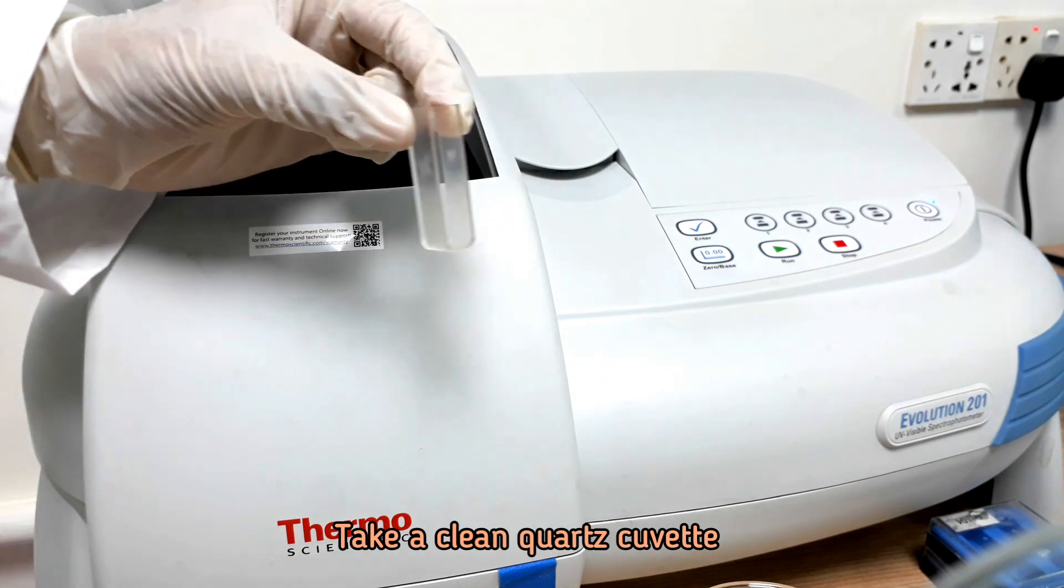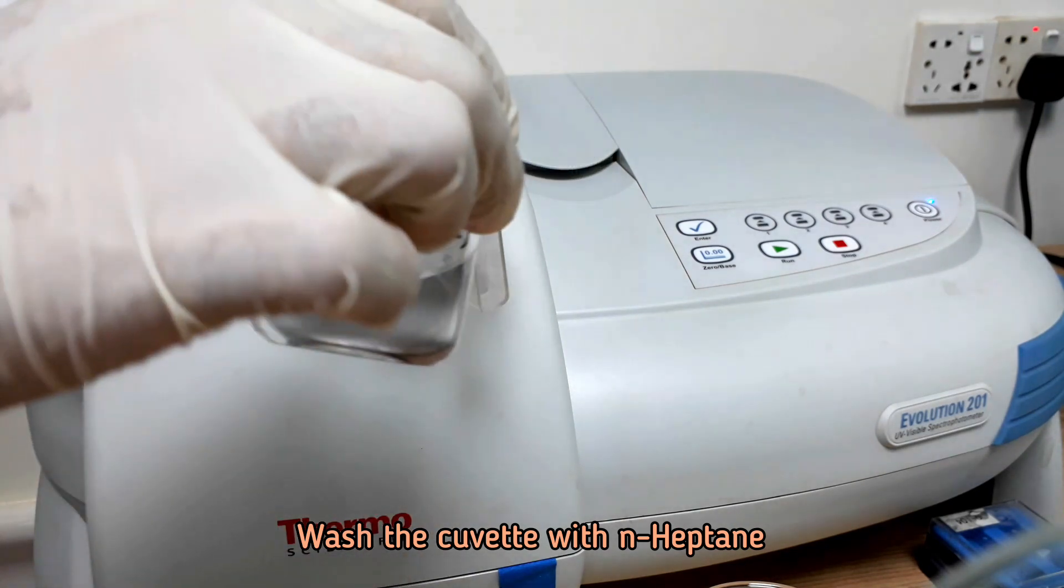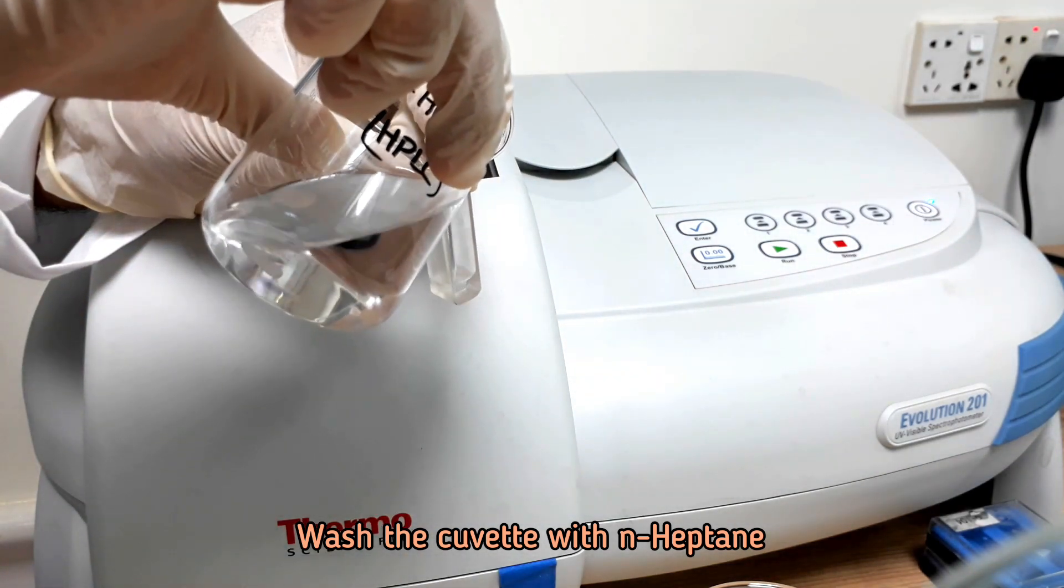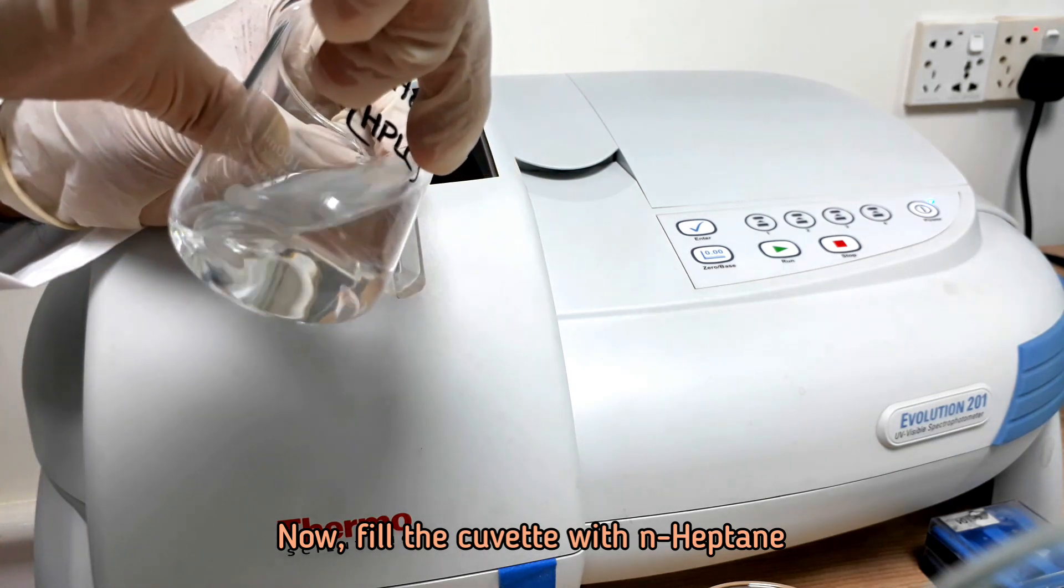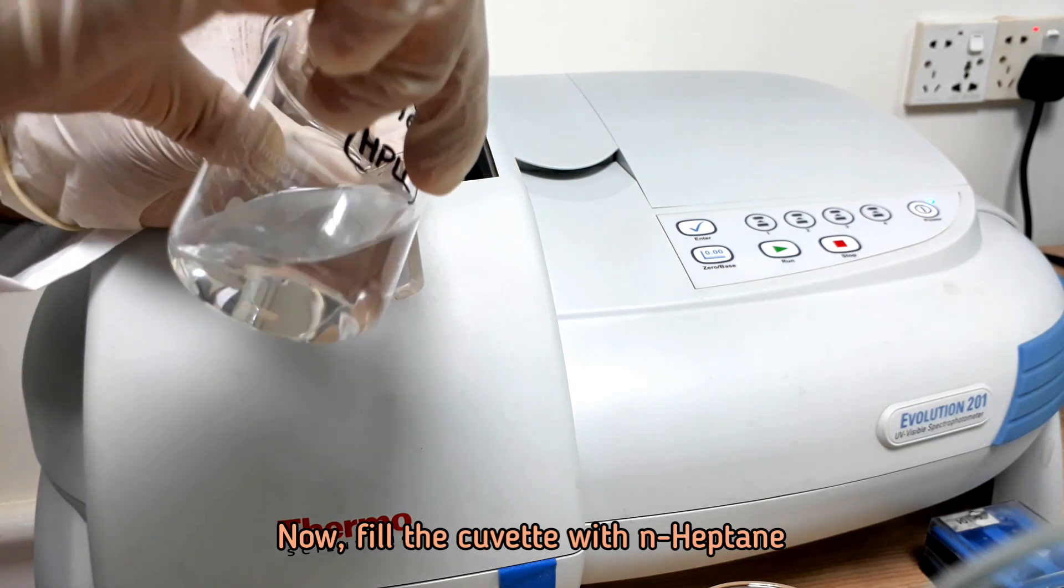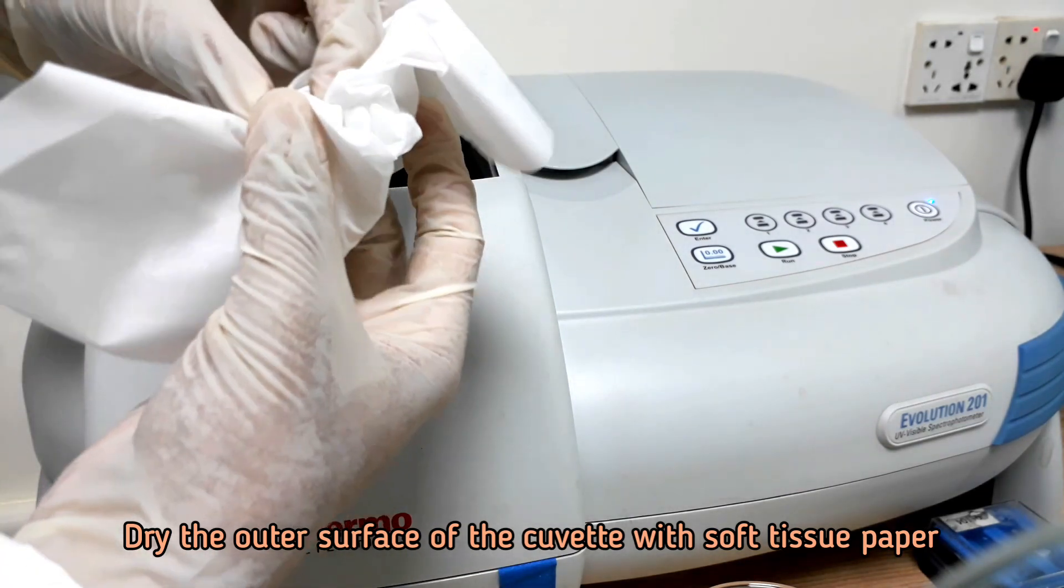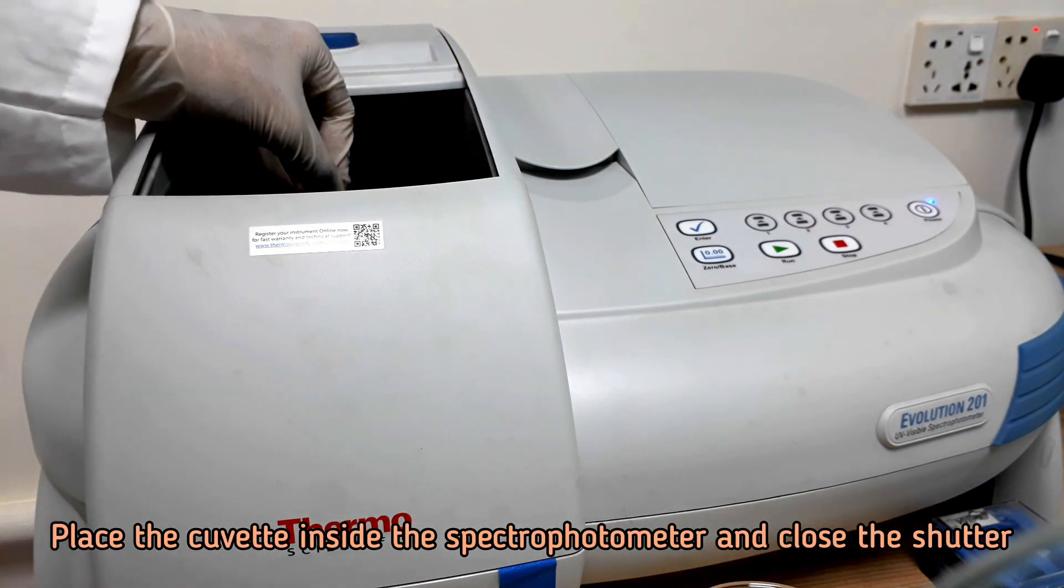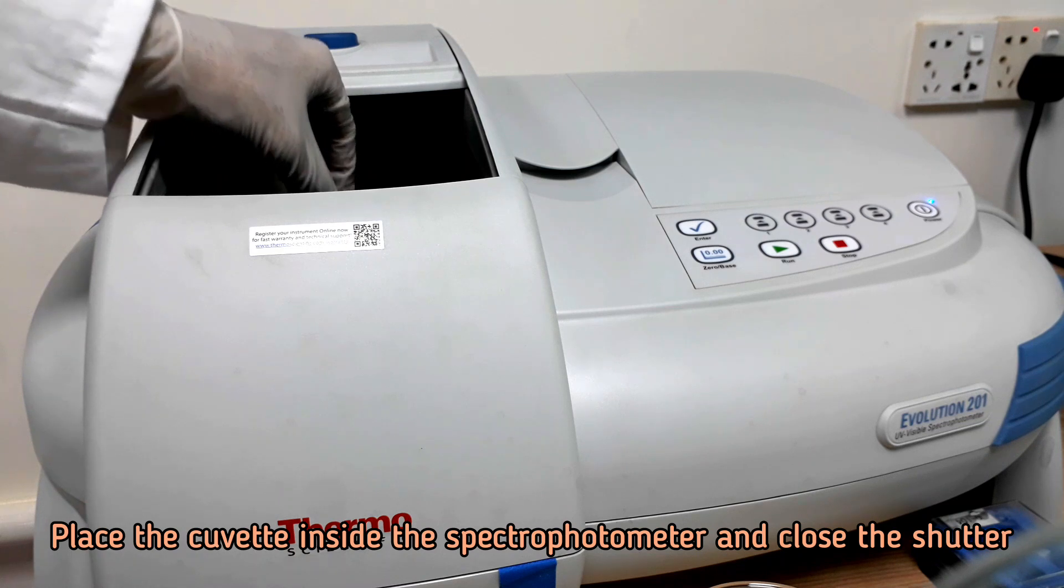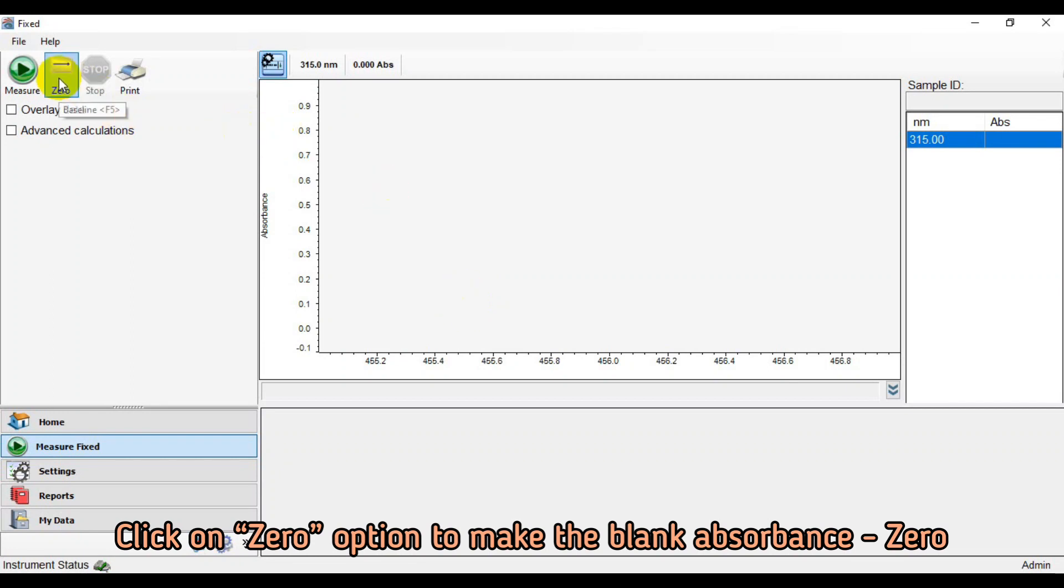Wash and fill a clean quartz cuvette with n-heptane. Dry the outer surface of the cuvette with soft tissue paper. Place the cuvette inside the spectrophotometer. Click on 0 option to make the blank absorbance 0.